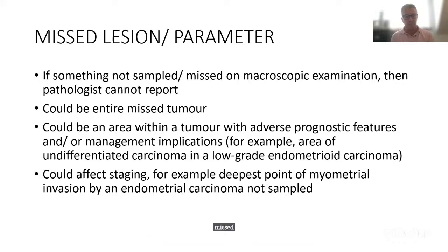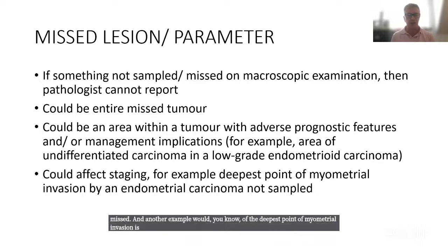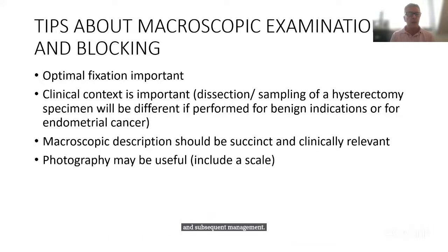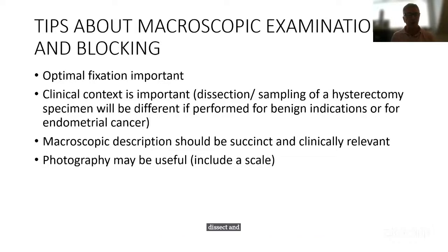Another example would be, if the deepest point of myometrial invasion is not sampled, this could affect staging and subsequent management. So just some other tips, I think we're all agreed that optimal fixation is very important. It's much easier to dissect and sample things if they're well fixed.